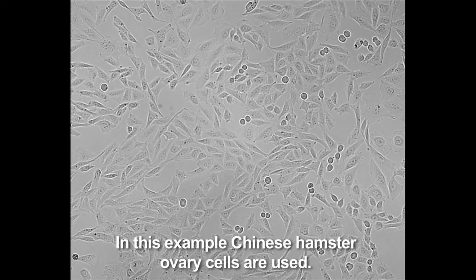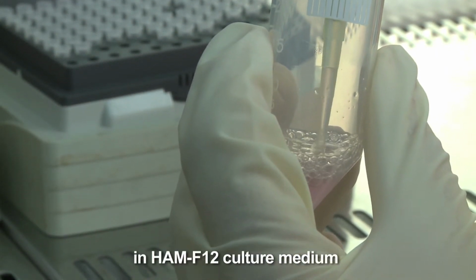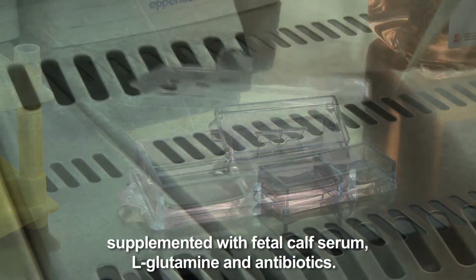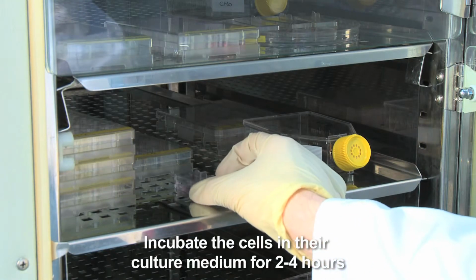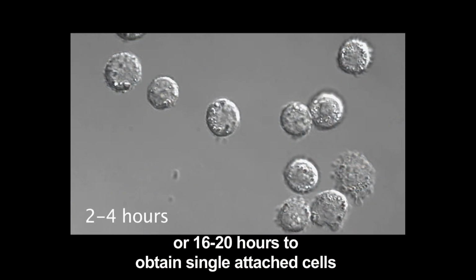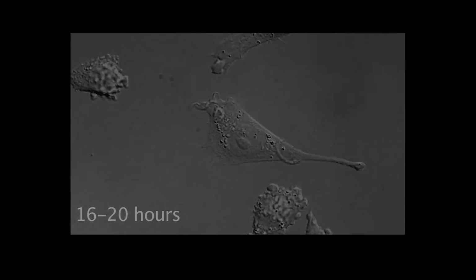In this example, Chinese hamster ovary cells are used. Plate the cells in chambers at 100,000 cells per chamber in HAM F12 culture medium, supplemented with fetal calf serum, L-glutamine and antibiotics. Incubate the cells in their culture medium for 2 to 4 hours to obtain attached cells of spherical shape, or 16 to 20 hours to obtain single attached cells of more complex shapes.